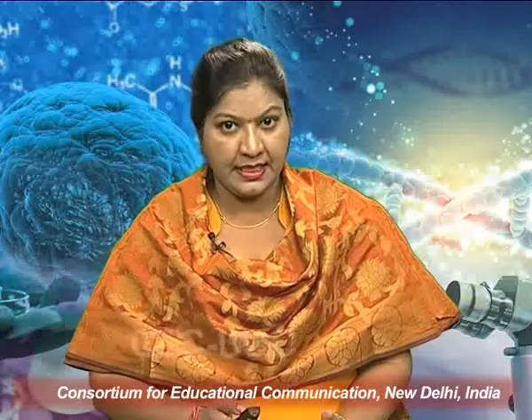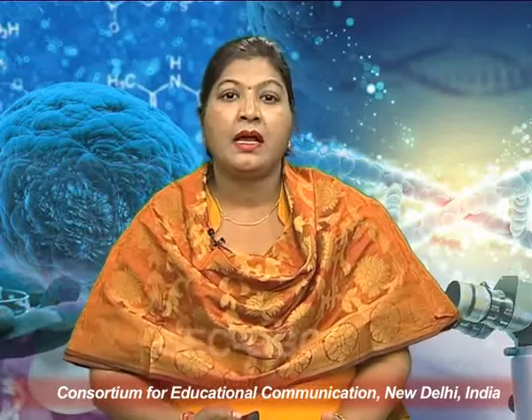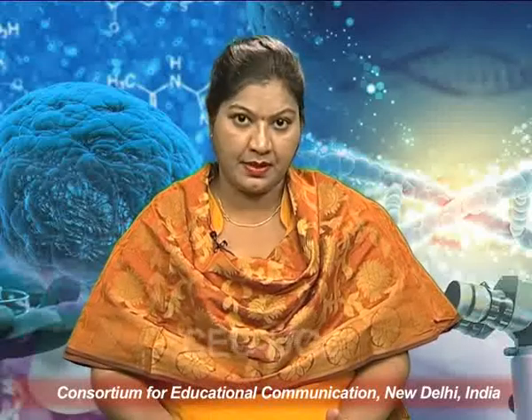So we are discussing that the cantilever is attached with the tip, and this tip scans the surface and works as a microforce sensor. Basically we are calculating the force between the tip and the sample. How can we calculate the force? It should either be in contact, or not in contact but very near to the surface, or it must vibrate on the surface.